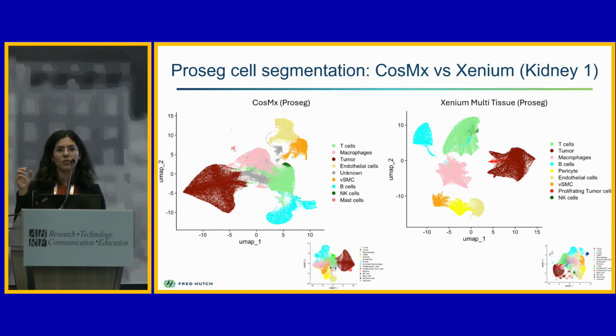No, we get the transcripts out of the transcript files. Right, then you train a segmenter or get your segmentation out of those transcripts. So you're basically using your results to define a cell, and so you're going to get supposedly a good clustering, or maybe I'm not thinking of it right, but I just think it's odd to use your results as part of your segmentation. Oh yeah, so the segmentation method is not a deep learning model that gets trained on it and then tested on a test set. It's not a machine learning algorithm, it's just a probability-based method.